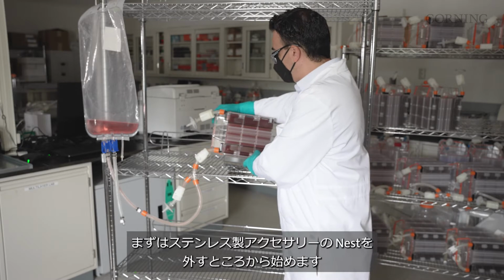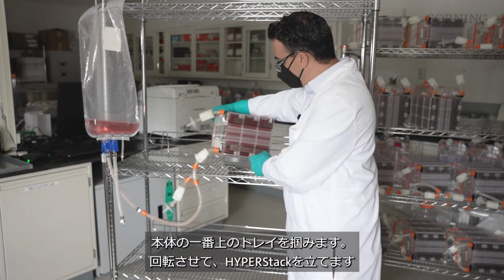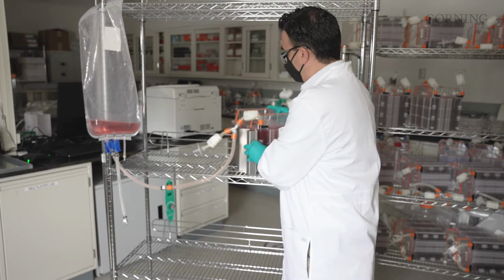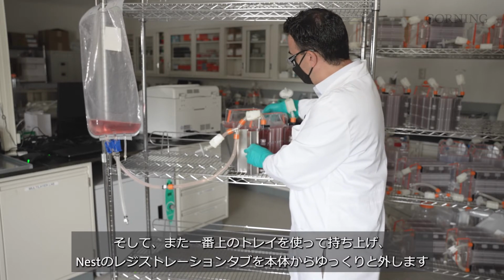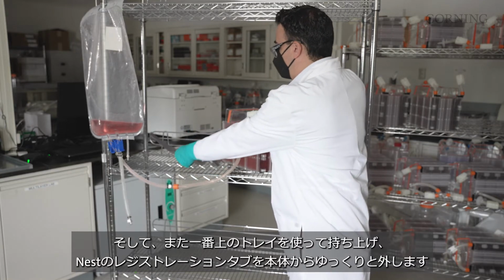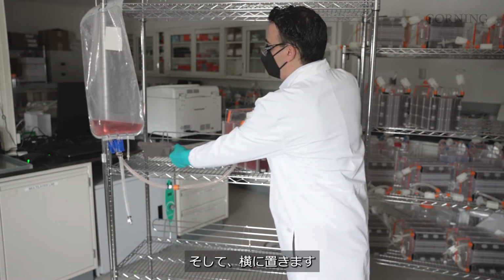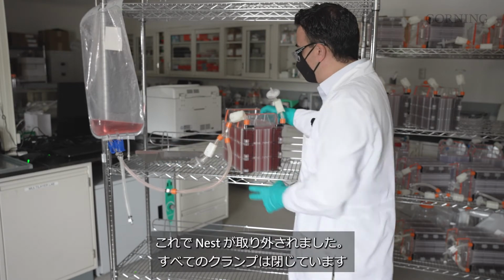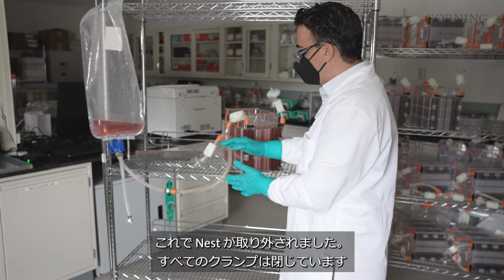stainless steel accessory. To do that, we're going to grab the top tray, we're going to pivot, stand the HYPERStack up. We're then going to lift, again using the top tray just gently to remove the registration tabs from the Nest. We can then set that off to the side. Now we're disconnected from the Nest. All of our clamps are closed.